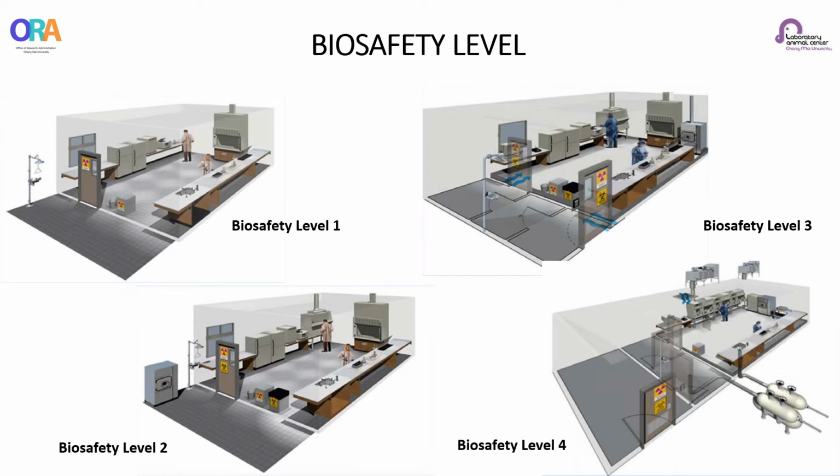Okay, first is BSL-1, or biosafety level 1. Laboratories are used to study agents not known to consistently cause disease in healthy adults. Workers in this laboratory use standard safety practice and standard microbiological practice. No special primary or secondary barriers are recommended other than an indoor hand washing sink and non-porous work surfaces that are cleanable and easy to decontaminate.